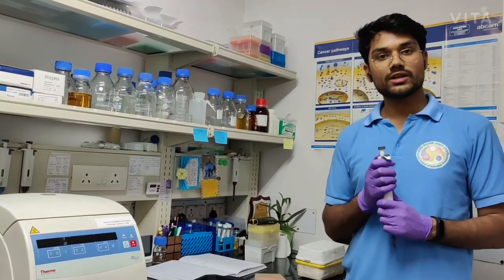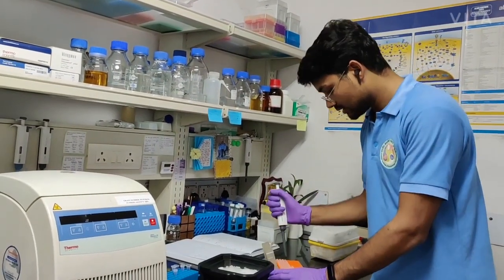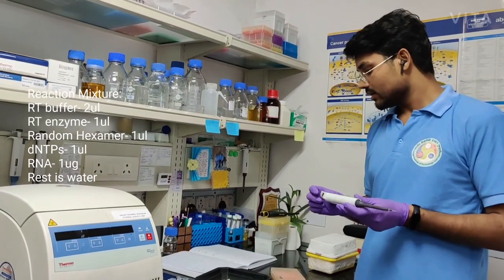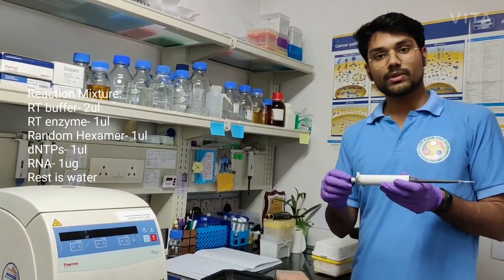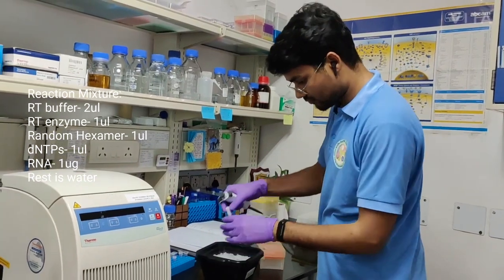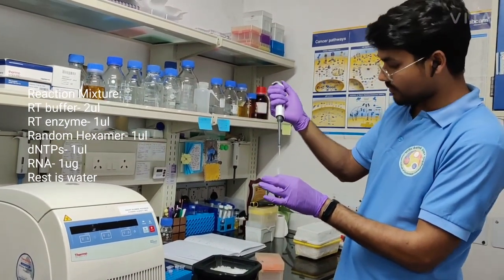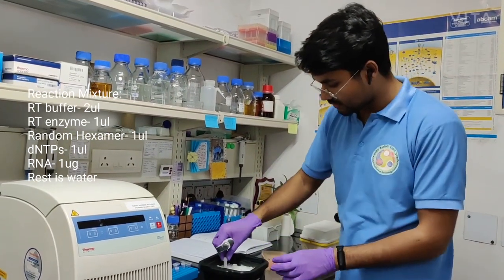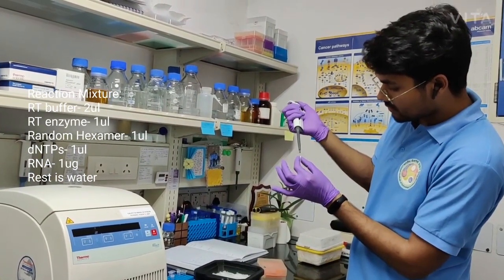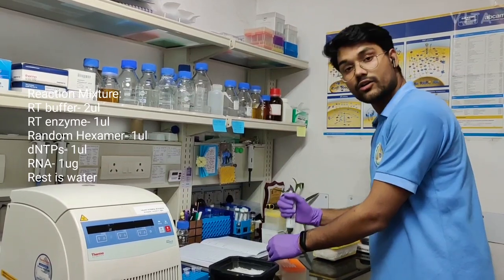Now, as the RNA isolation is done, in this video I will be showing you how to prepare the cDNA from the RNA. I will be preparing 10 microliters of reaction, and in 10 microliters I will be adding 1 microliter of random primers to prepare the cDNA. This is the random hexamer that I will be using for this. For the cDNA preparation, everything should be on ice. After the primer, I will add 1 microliter of dNTP.